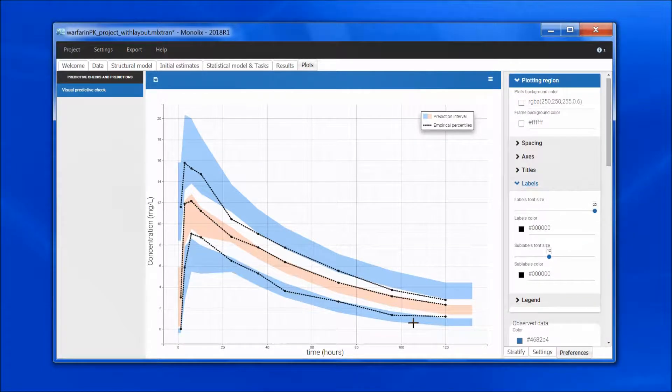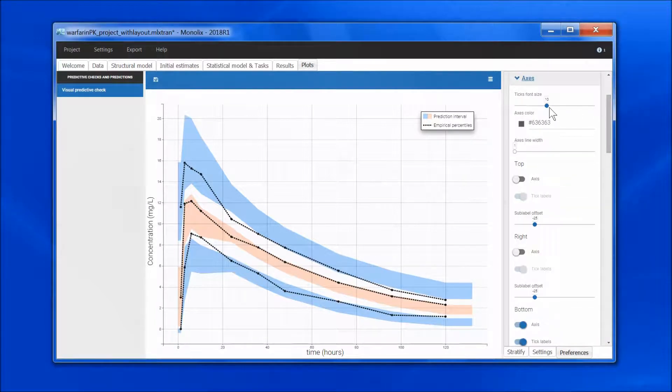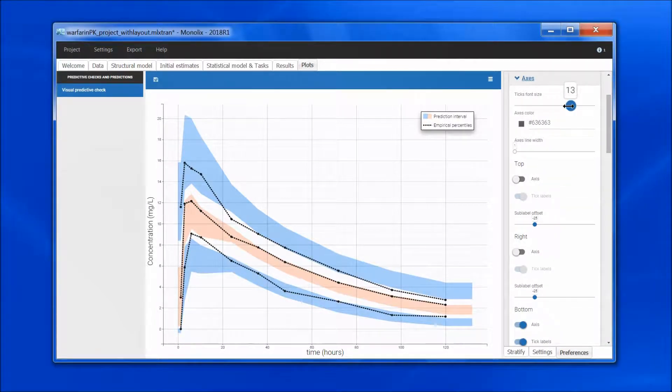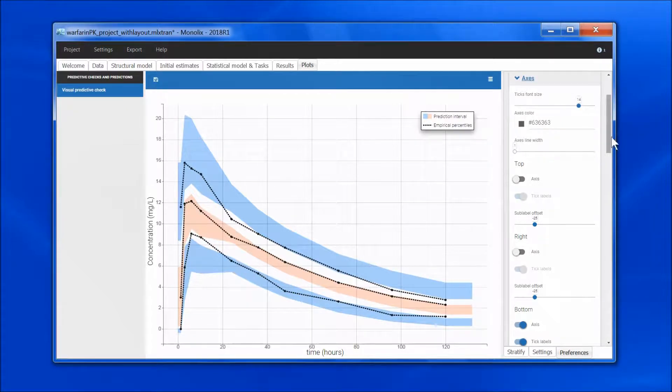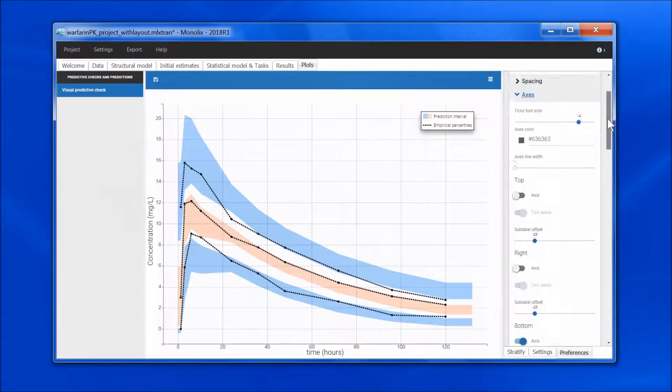For the axis, I go to axes, and here change the font size to let's say 40. If we find it a bit too crowded, we can also adjust the spacing.